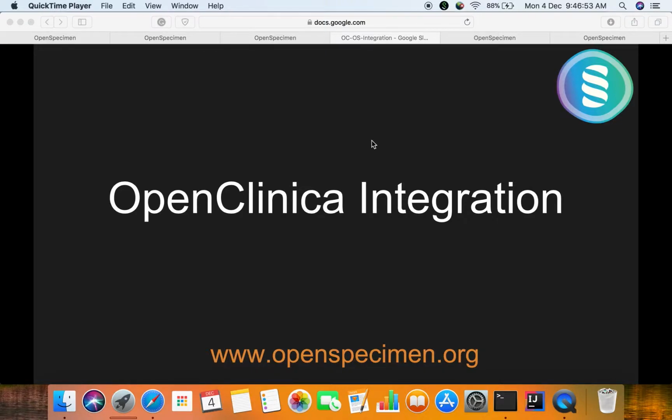Hello and welcome. In this video, I will demonstrate integration of OpenSpecimen with OpenClinica. OpenSpecimen is a leading biobanking software responsible for management of biospecimens. OpenClinica is an open source software for management of clinical data.